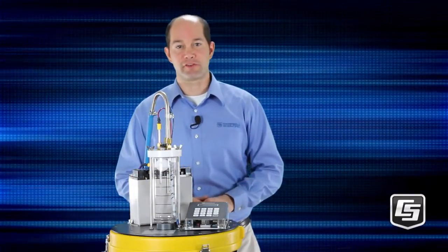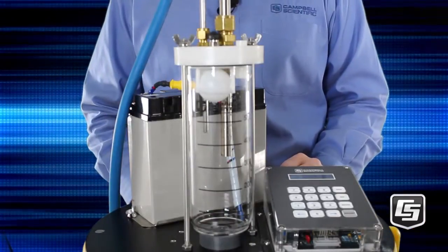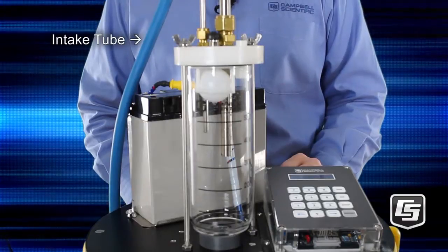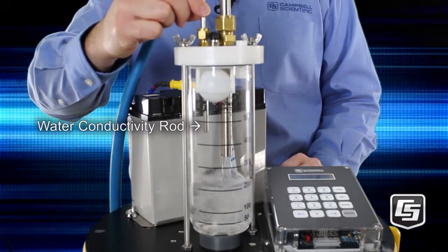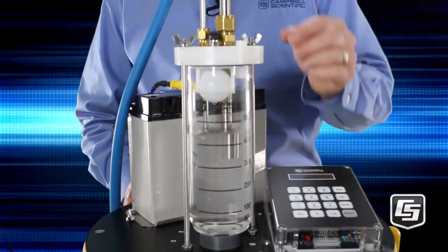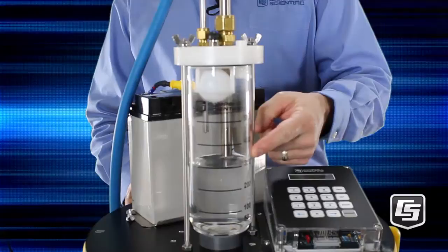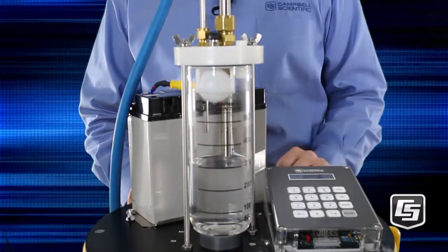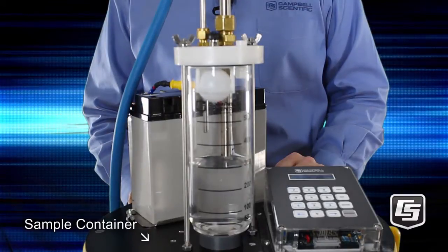Let's start by drawing a sample. We'll do a quick manual sample. First, the line is purged to ensure a fresh sample — the water is being purged from the intake tube, the line coming out here. Now the water will fill the chamber until it touches the conductivity rod. As soon as that happens, it drops down to the level of the control rod. The excess water is then purged out the intake tube, and the water is then released to the sample container.